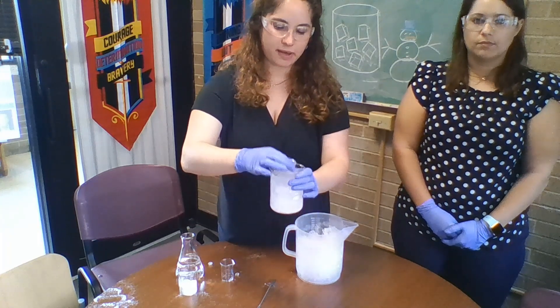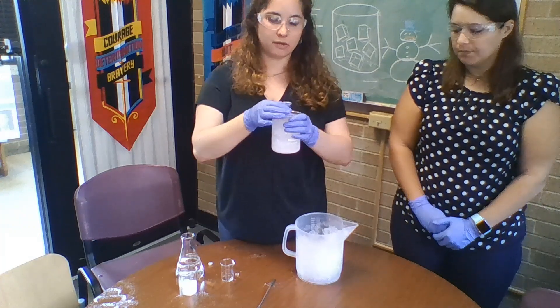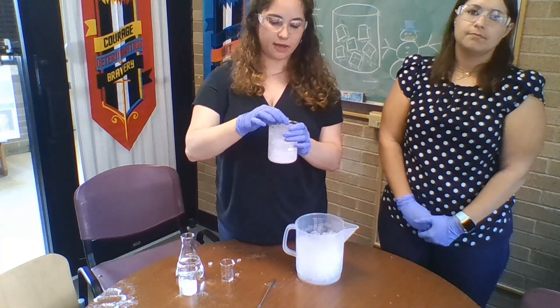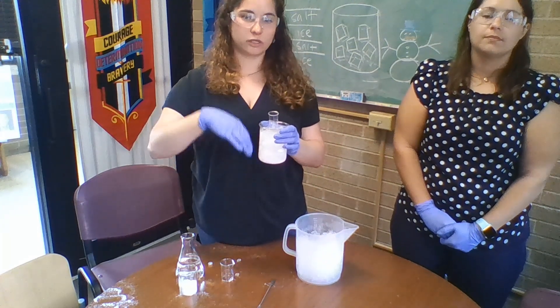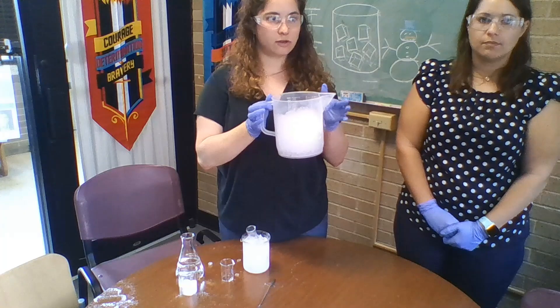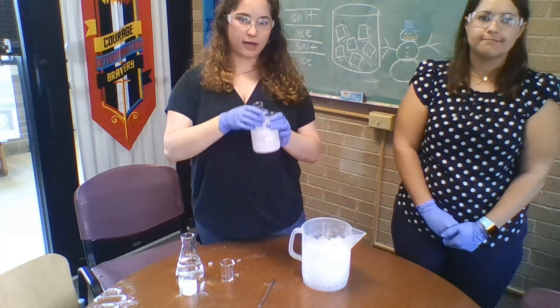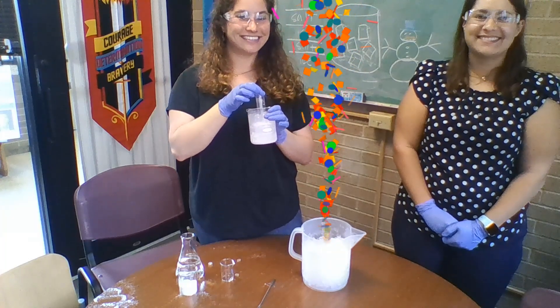Now I have a nice slushy ice bath. If this continues to melt — which it will because it's probably going to be warm next week — you're going to need to slowly filter out water. Every time you dump some water, keep in mind that you're also dumping out salt, so you're going to need to add more ice and more salt. You may want to just go get ice when it looks empty because you're going to need it anyway. If you follow those rules, you will have a successful experiment. That's the end.